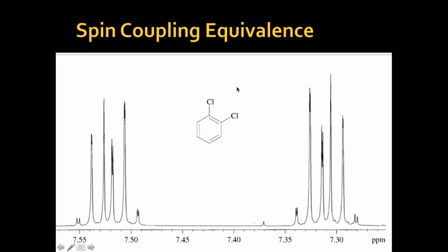The molecule with C2 symmetry, the symmetrical molecule, if I cut it, has a mirror plane of symmetry, which means it shows the same set of peaks. How to interpret the aromatic spectrum, we will discuss in time.